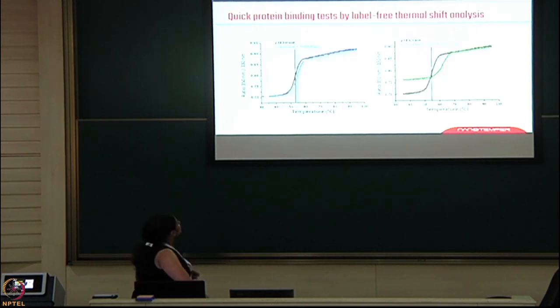Now, this is a thermal shift assay that we have done, where we have taken a kinase, and then the kinase is treated with a ligand molecule. You can see the shift in the assay. Protein alone was giving a shift at 50-55, and once it's added with the ligand, the shift has gone to 62. So that is how you can check the thermal assays.